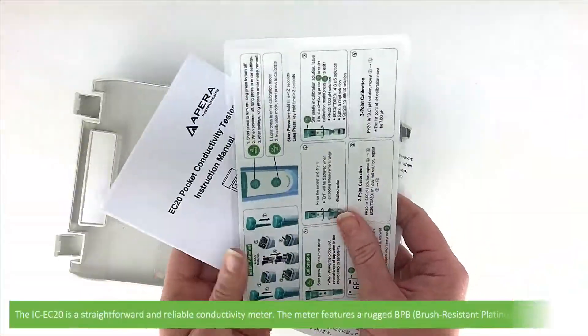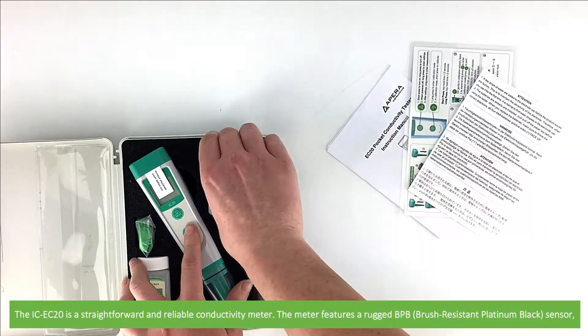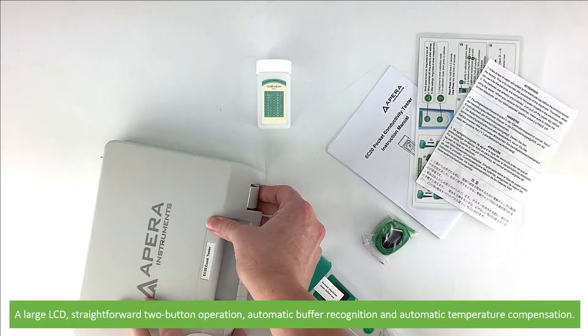The IC EC20 is a straightforward and reliable conductivity meter. The meter features a rugged brush resistant platinum black sensor, a large LCD, straightforward two-button operation, automatic buffer recognition and automatic temperature compensation.